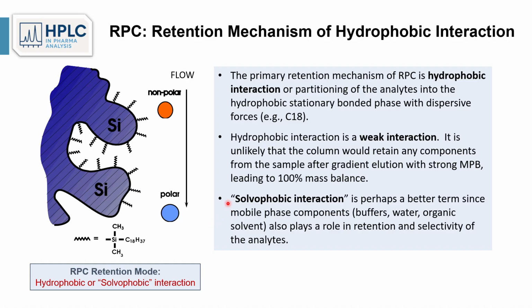Perhaps the term solvophobic interaction is a better term, since there are some interactions of the mobile phase components, which consist of buffer, water, and organic solvent, and they play a role in both retention and the selectivity of the analyte under reverse phase conditions.